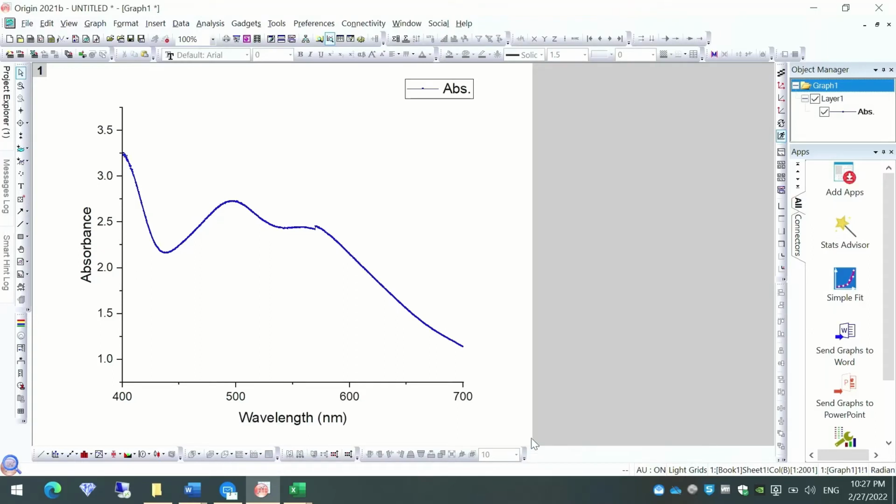I think that looks much better. Okay, what else can we do? We can also bring this box near or anywhere you want to place it. I think here it looks the best.